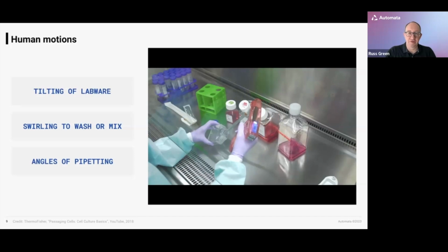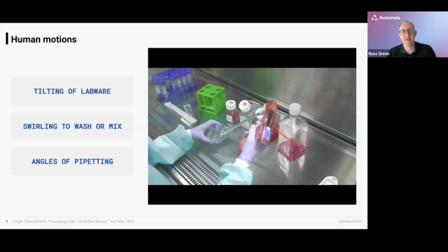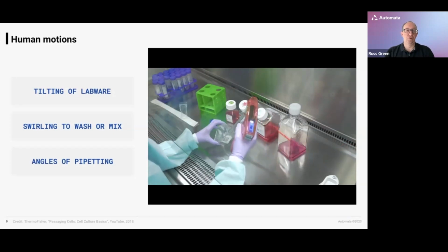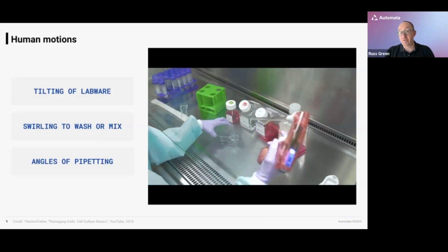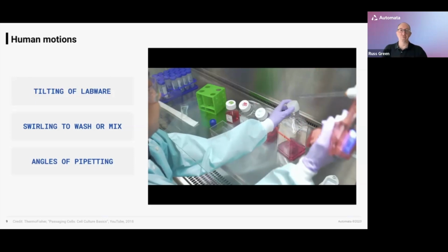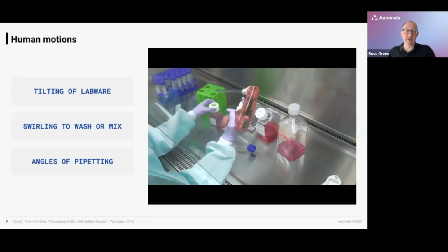As we go into the next part of this process, you can see once the wash buffer has been added, the PBS here, that the cap is then returned, and then the labware is rocked and shaken in order to give a wash. So these are all things which we need to think about how we're going to recreate in an automated environment, and what's going to make those more viable to do robustly and routinely.